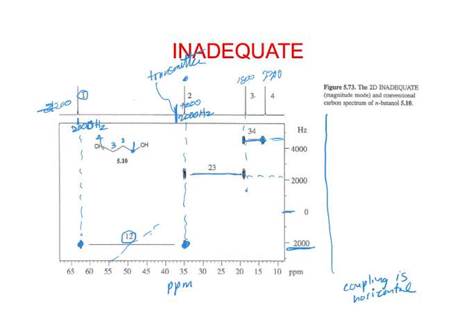So we have the transmitter in the middle, which is just set at 0, and then I guess it's the sum of how far they are away. I don't know quite why they do it like that. It'd be nice to just have it plotted out like a COSY or something.